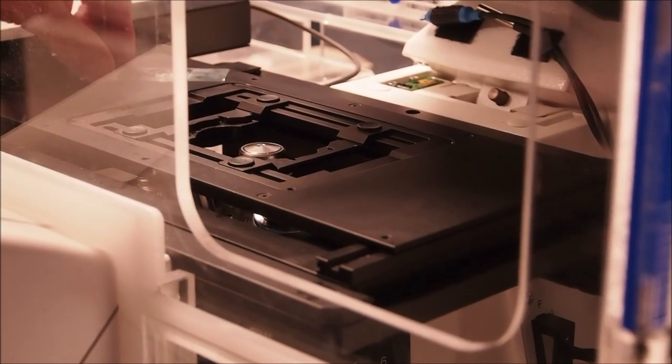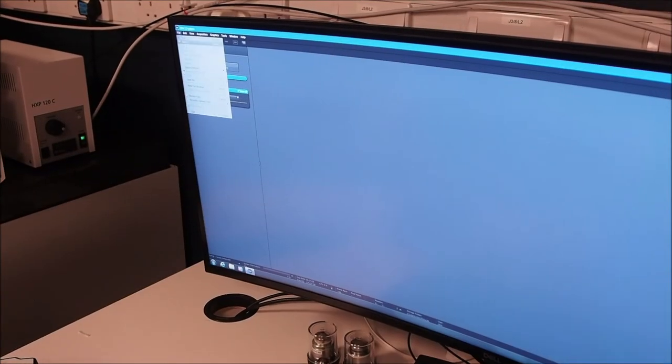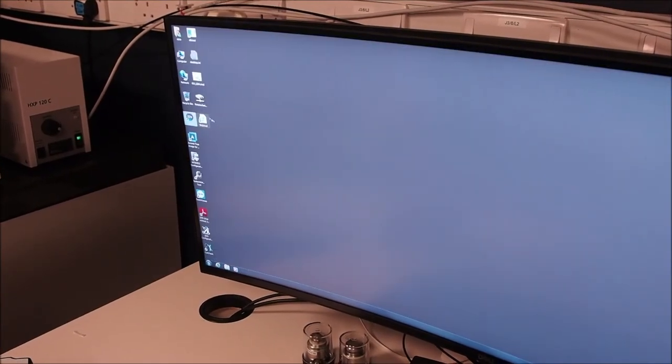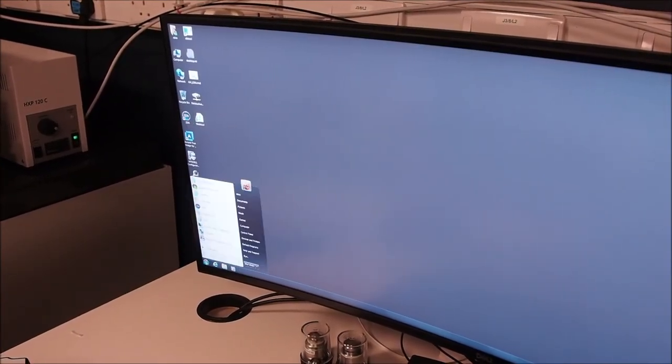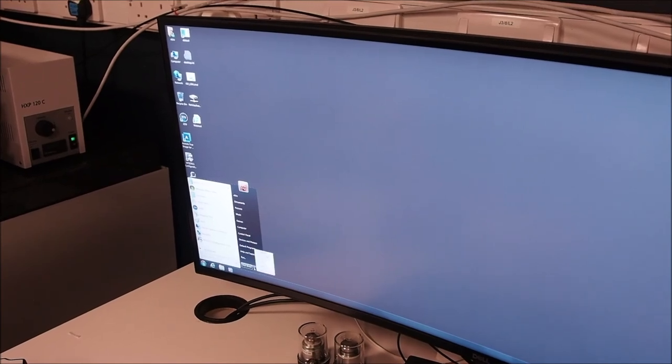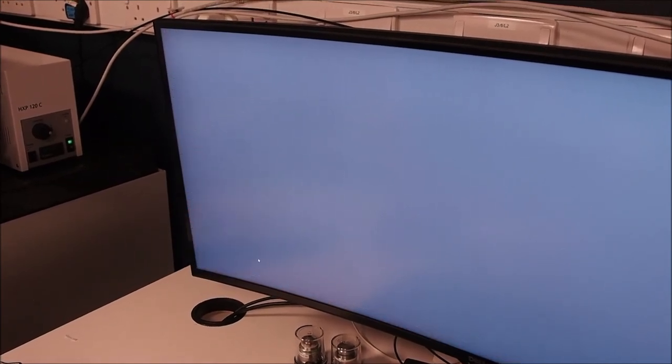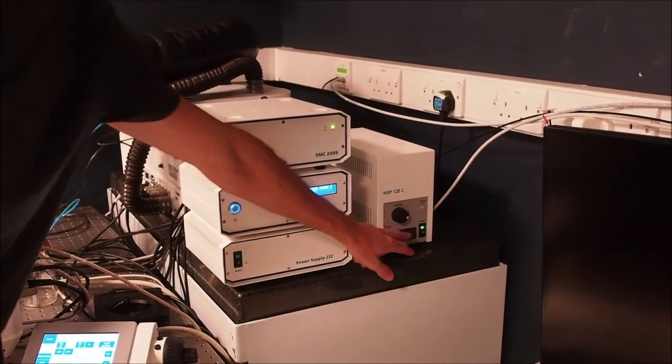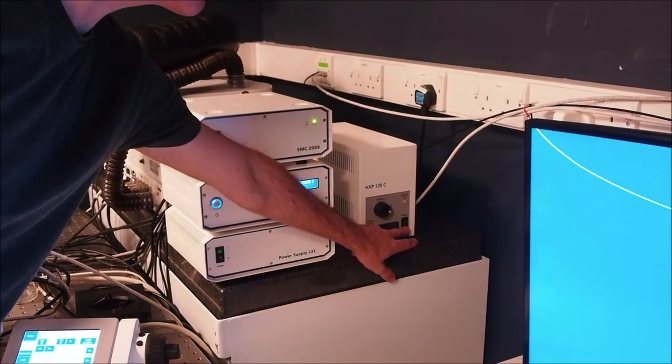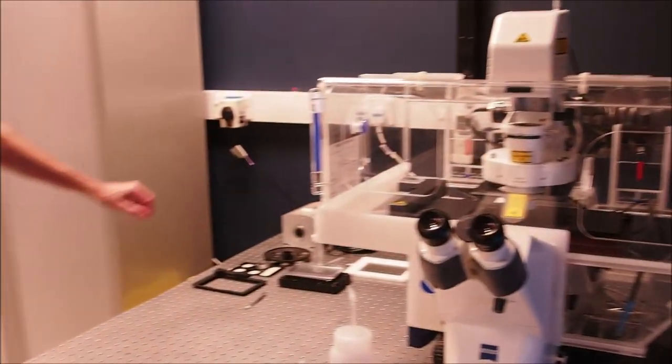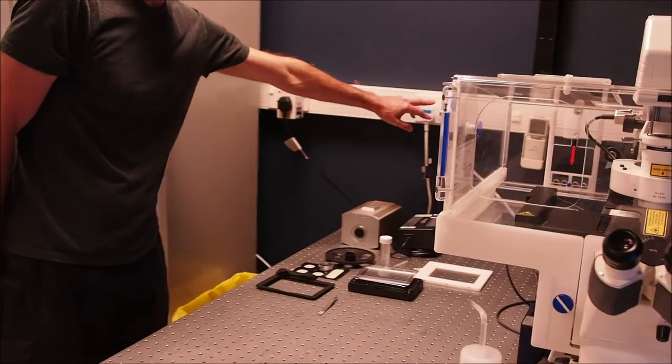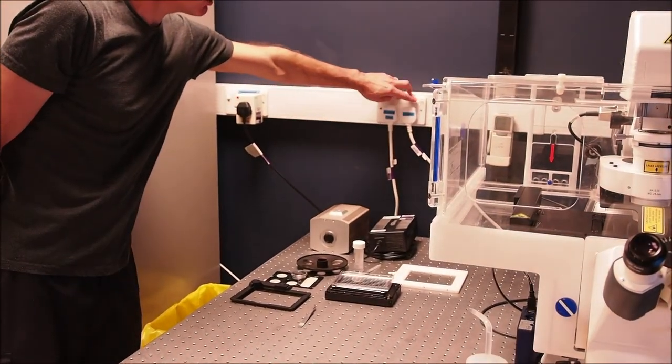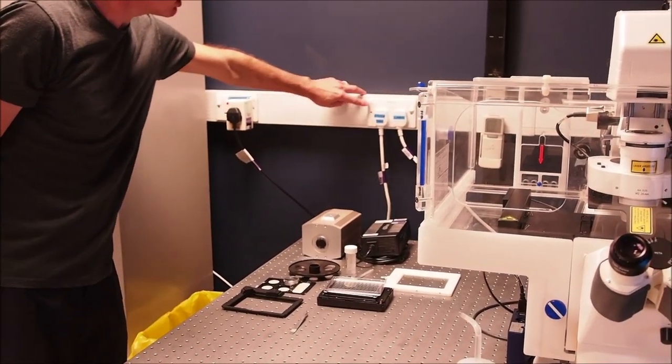Now you can close down the software and hardware. Ensure all images are saved, then close ZEN. A warning message will appear telling you ZEN service is shutting down. Wait for this to close before logging off the PC. Switch off the HXP fluorescence lamp to the left of the monitor. Next, switch off the three wall plugs to the left of the microscope and close the incubator doors to protect the machine from dust.